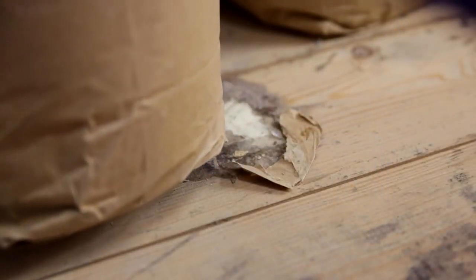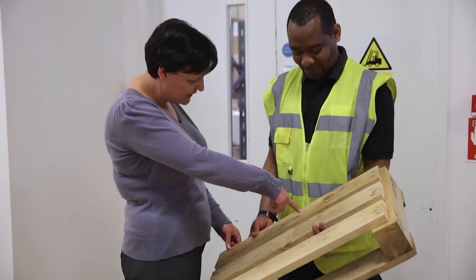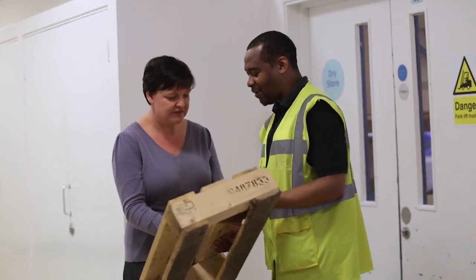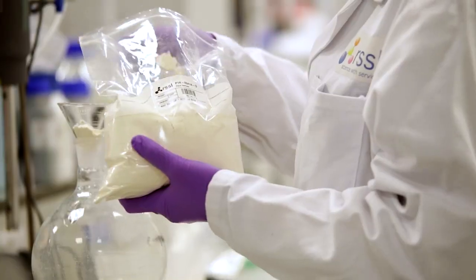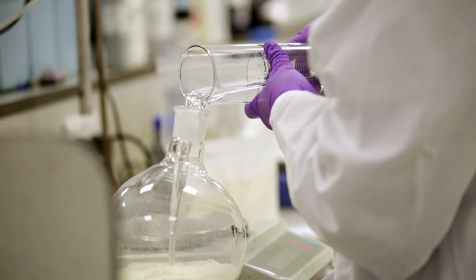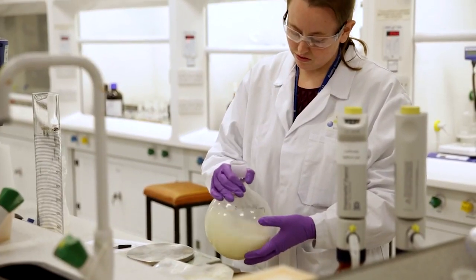Our customer advised that following an internal audit, the complaint samples have been linked to a specific batch of raw ingredient, flour. To assist in identifying the root cause of the tainted flour, we visit their site and find that flour is shipped and stored on wooden pallets. Samples of retained flour and pallet wood are analysed using the steam distillation solvent extraction, which is invaluable in root cause analysis due to being suitable for a range of sample matrices.